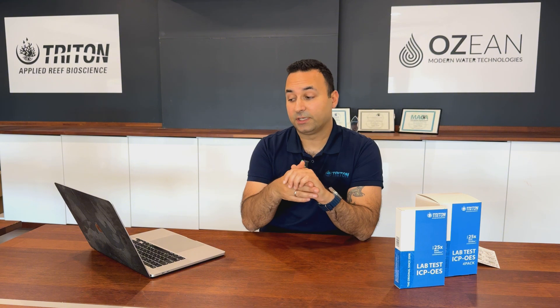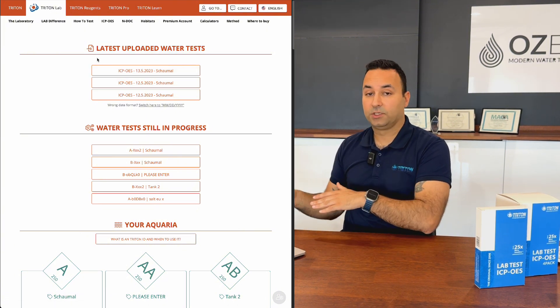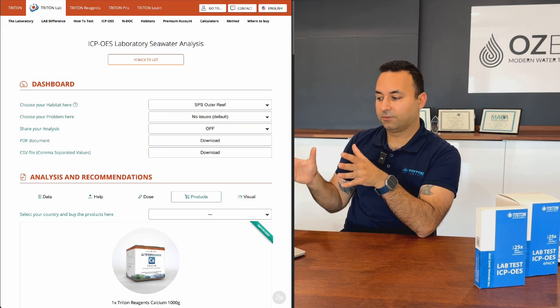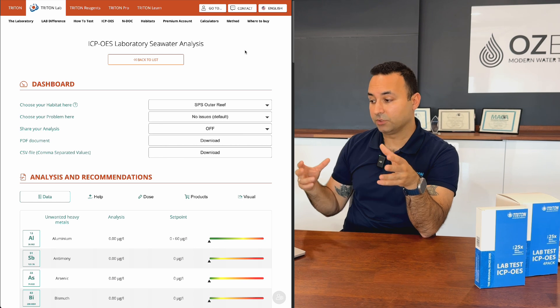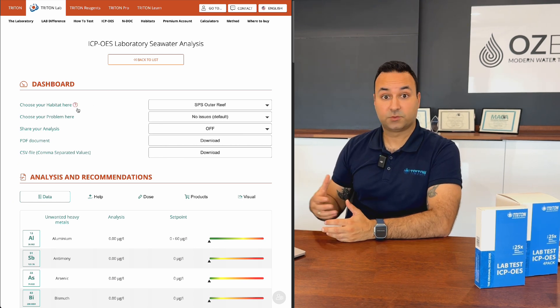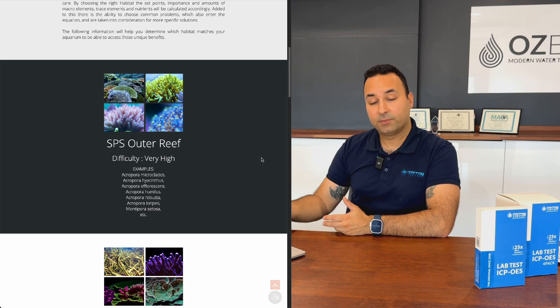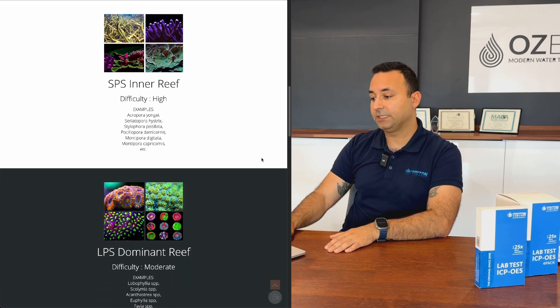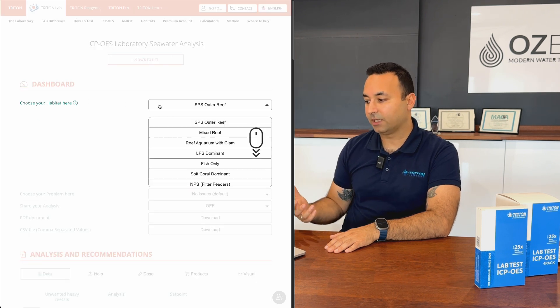Once results are uploaded you receive an email and can view them on your account. The most recent test always appears at the top — click it to go straight to your results. The first key thing you'll notice is our habitat-based system. We need to know what type of aquarium you have and what corals you keep, because different corals need different things.